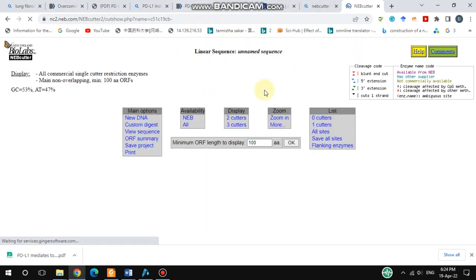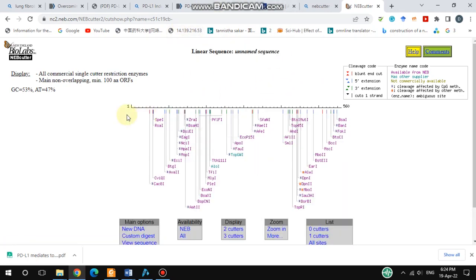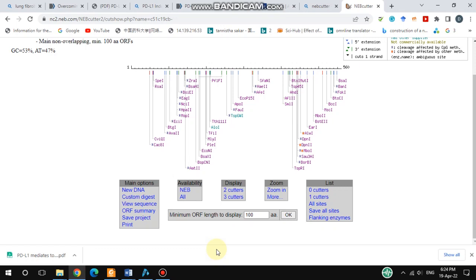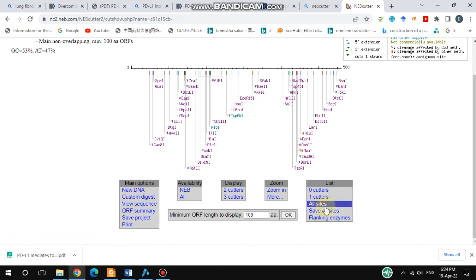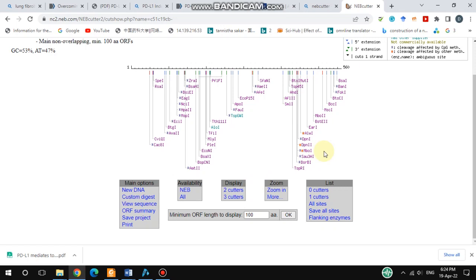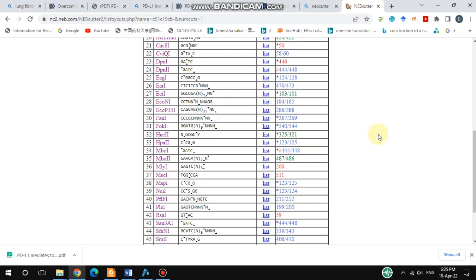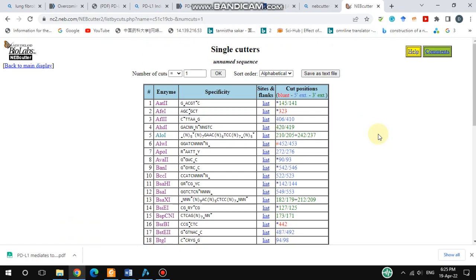After submitting, all the restriction enzyme sites available in your sequence will be shown here. There are also filters: one cutters, zero cutters, all sites. If you choose one cutters, it will show only the one-cutter enzymes.